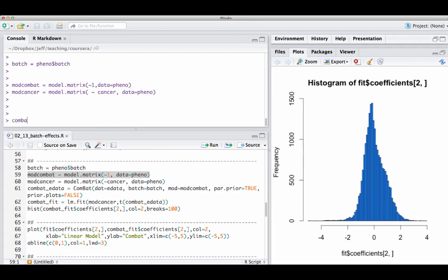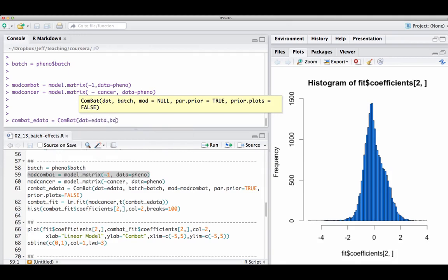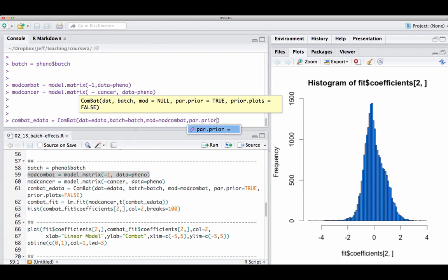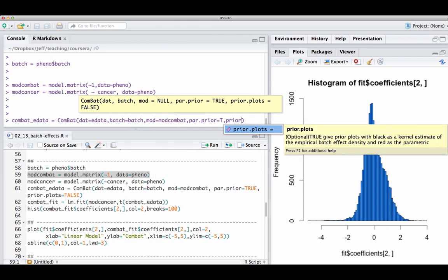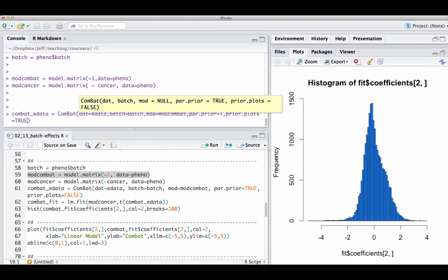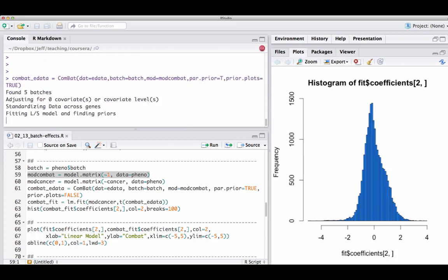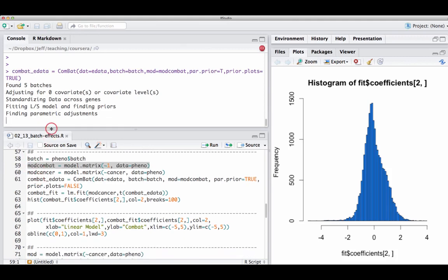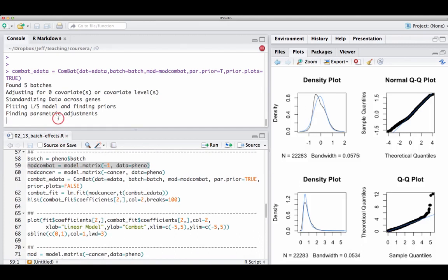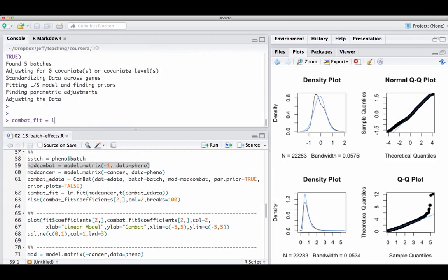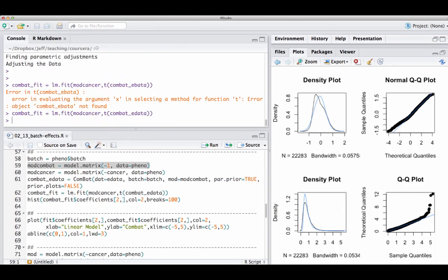I run ComBat to get a cleaned expression data set. I pass it the expression data, tell it what the batch variable is, and specify anything else it should adjust for. It fits a set of models and can optionally plot output. Essentially, it regresses out the batch effects. Then I can run lm.fit on the cleaned data — fitting the cancer model matrix on the ComBat-cleaned data set. Now I have the ComBat-fit coefficients, which I can examine.